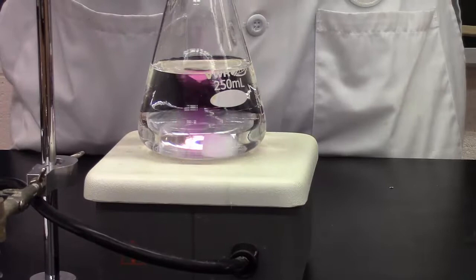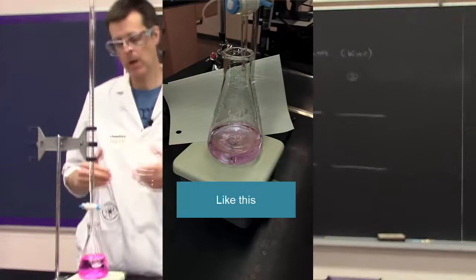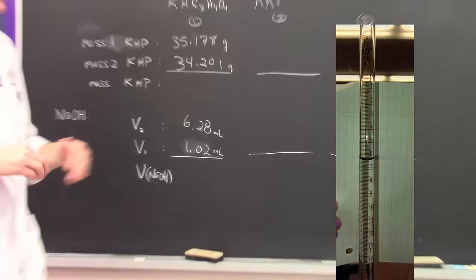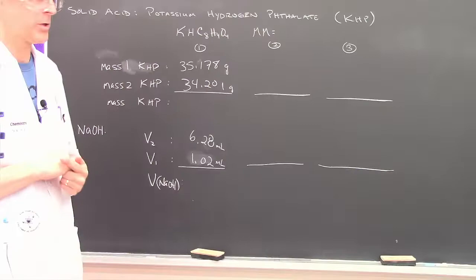So I've titrated it to—I would like to have a fainter pink than this. I'm a little bit past the part where I should be. I'll try this again. I took my second volume measurement, I'll post a picture of that. I estimated it to be about 6.28 mL. I can do the 6.2 part really well, those are the graduations, but it was almost 0.3 but not quite, so I'm estimating it to be 6.28.